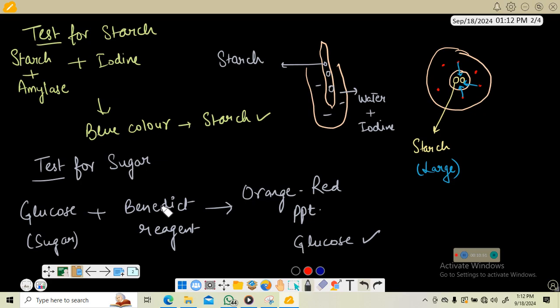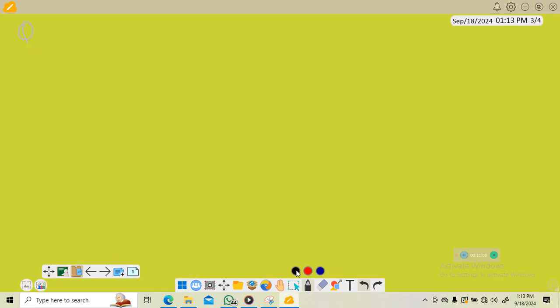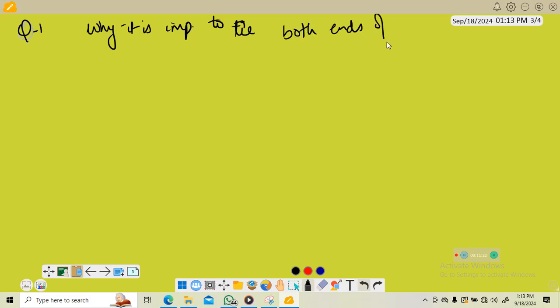Now, coming to questions. The first question is, why is it important to tie both ends of the tubing?